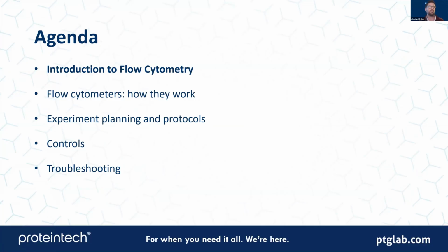So just for a quick overview of what to expect from the talk this evening, if you're in the UK, or this morning if you're in the US, and anywhere else in the world, welcome as well. We're going to start with a quick introduction to flow cytometry, what it is and what you might use it for. I'd like to do a little bit about how flow cytometers work. I think they're pretty phenomenal bits of kit, so it's useful just to get an idea of the setup and what your samples are going through.